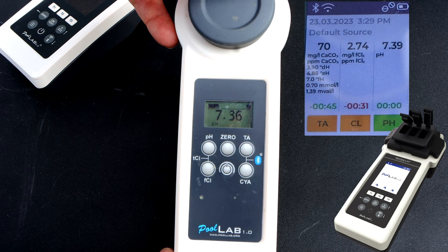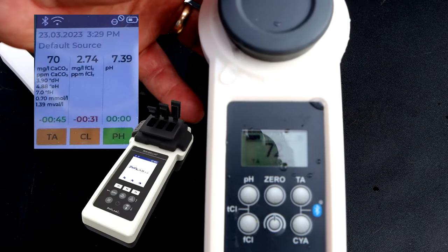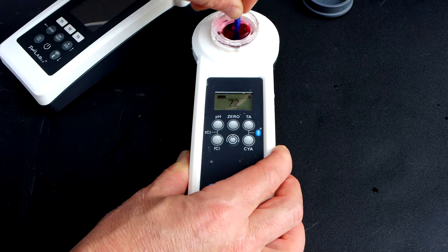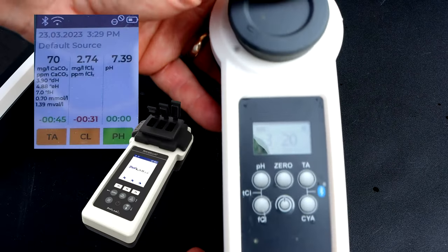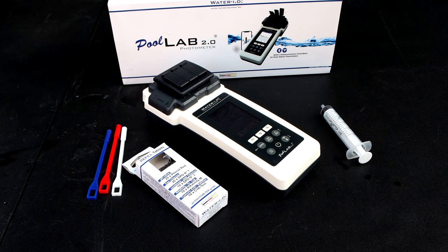The pH is coming in at 7.36 and the total alkalinity is coming in at 72. The free chlorine is coming in at 3.2.